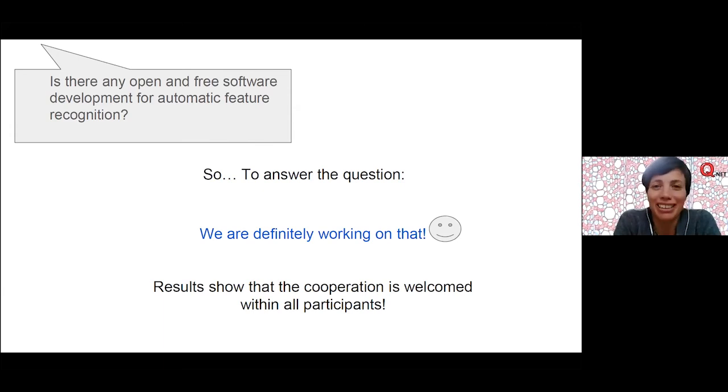This is a very practical question. Yes. Thank you, Angela, and thanks for the question. There is no single answer, like it takes 10 minutes or it takes 5 minutes. It depends on the resolution that you want to obtain. It depends on the quality that you want to obtain, and it depends on the features that you want to see.